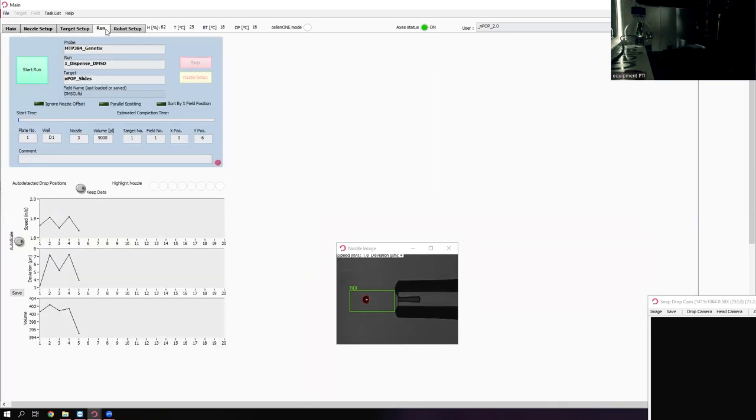Those templates are already provided. And we have various templates if you want to do, for instance, three cell types, three cell samples. So those are already developed. If you had seven cell types that you wanted to run in one of these, we're in the process of launching this nPOP partnership program because of the complexity of the process. In the interest of getting people to actually generate good data and not struggle trying to figure out technical details, we see it as kind of a service contract.